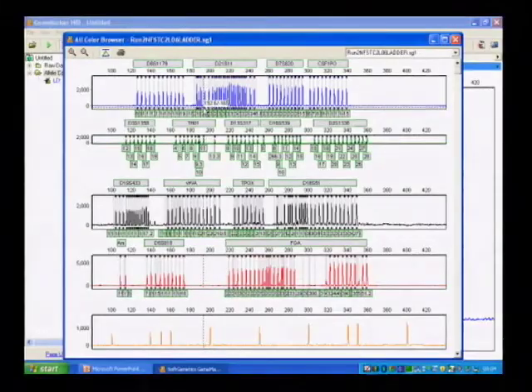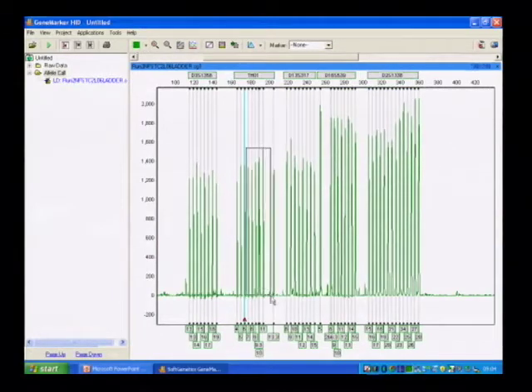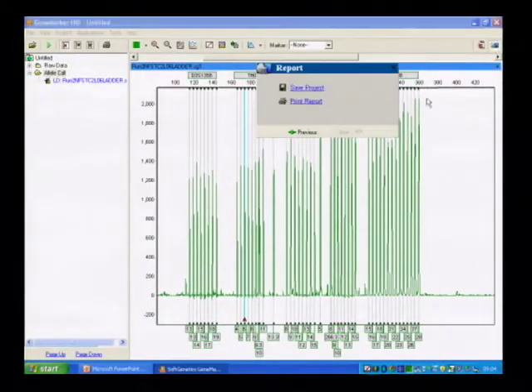So the ladder is created, and what you see from here is essentially the Allelic Ladder, all of the loci and the alleles that are called. If you want to zoom in on THO1, we can just check on the resolution. And you see that 9.3 and 10 has quite high resolution, as we would expect from the discussions yesterday. So the Allelic Ladder is complete, and now what I'm going to do is just load in the rest of the lanes.